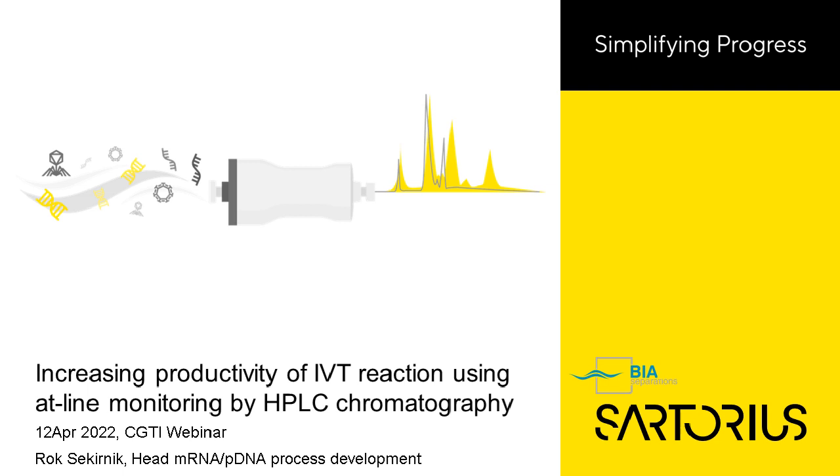But I would also like to understand this question broadly, and so I would like to consider in this webinar also factors that feed into the IVT, such as plasmid production, plasmid quality, as these are at the moment, I think, some of the very important and hot questions in the field of mRNA production. What is the right purity of plasmid and how to make it, how to purify it, and then I would also like to extend the productivity of IVT beyond the IVT reaction itself to the actual purification, so that we don't lose too much valuable material once we've made it.